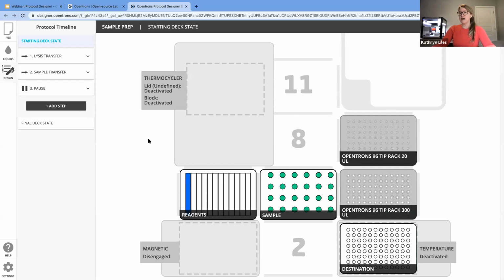And so we have a full preventative maintenance guide that we can provide that was built by our support team. It serves as an excellent source of documentation for how to care for the instrument and how to check things like accuracy and precision.